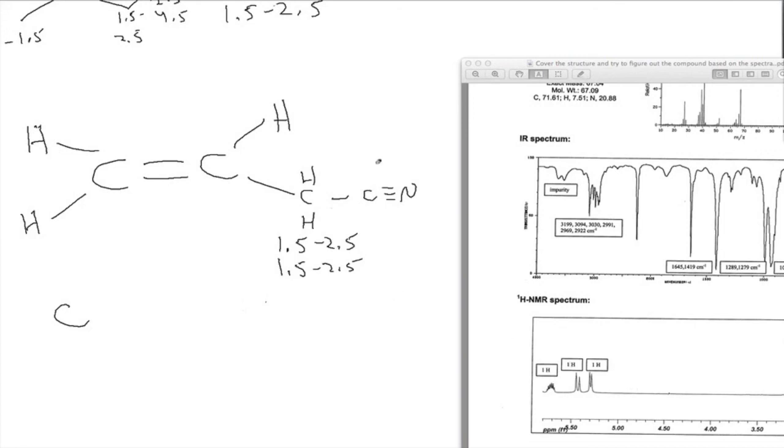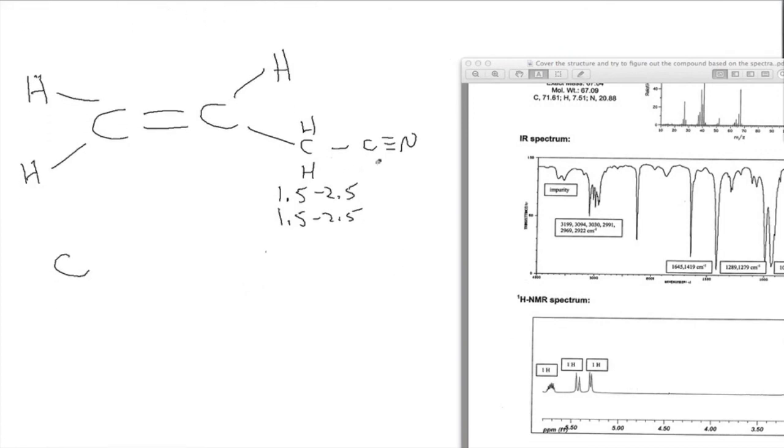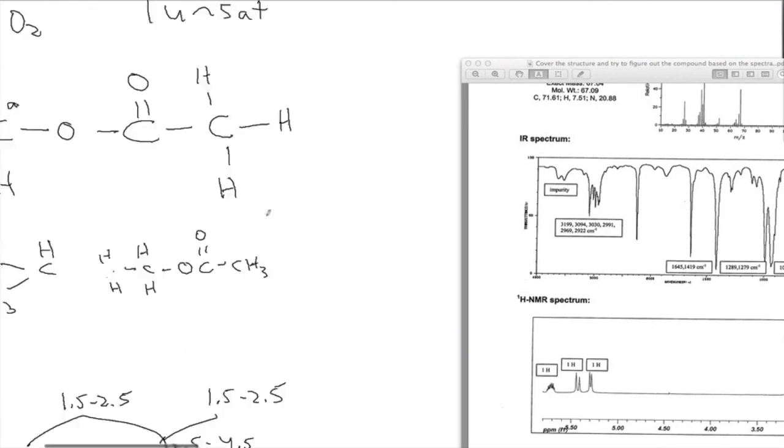Okay, so this is the first time we did an alkene. So I just wanted to remind you, here's the technique for an alkene. You're more likely to see that than a nitrile. It's easy to see when there's an alkene because you'll see a peak in the 4.5 to 6 region. So you immediately write this down. And then it's easy to tell how many hydrogens there are on the alkene by looking at the integration. So then you put however many hydrogens there are, and then whatever else is probably going to be a carbon, and then you can work away from that. So that's a good technique. That's the technique of working away from the functional group that we talked about before.